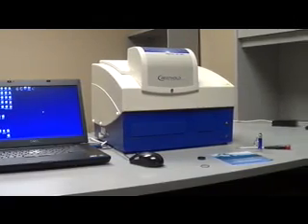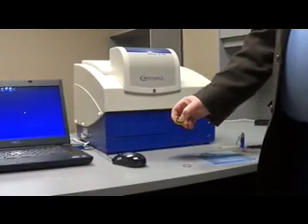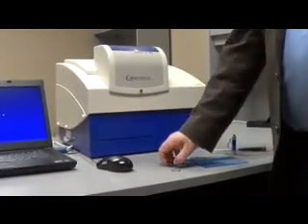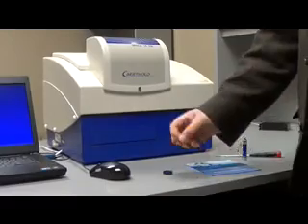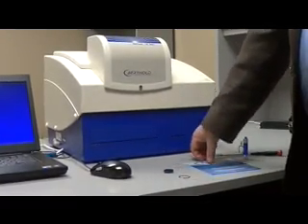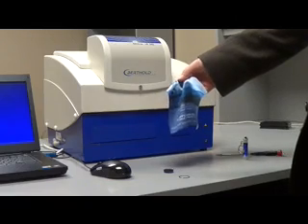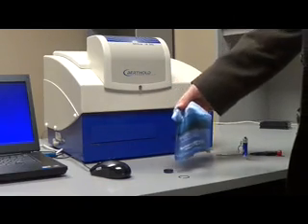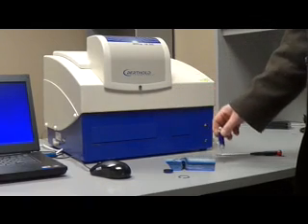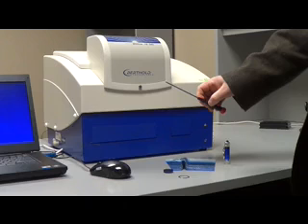A few things that will be needed: the actual filter that was ordered — this is a 535 nanometer filter — a clamping ring, an optical cloth for cleaning the filter in case you get any fingerprints on it, a flashlight, which does come in handy, and a small screwdriver.